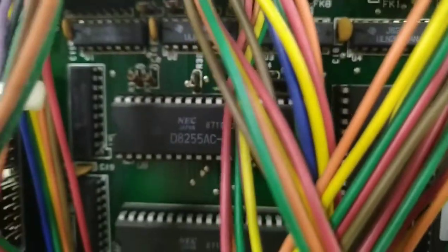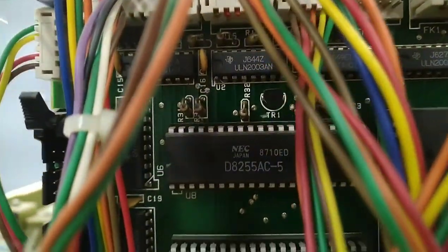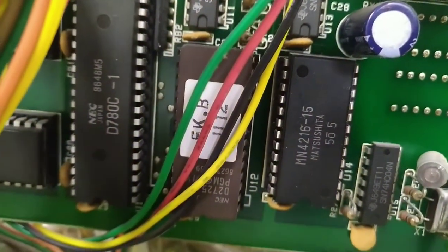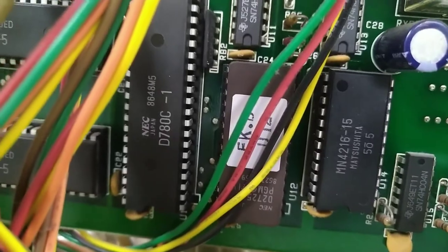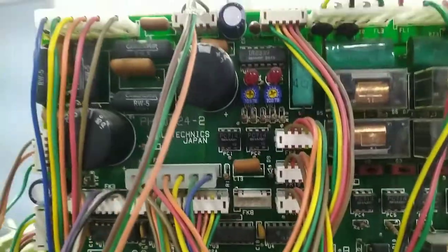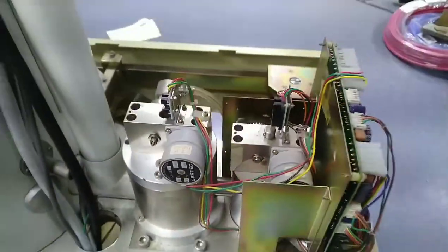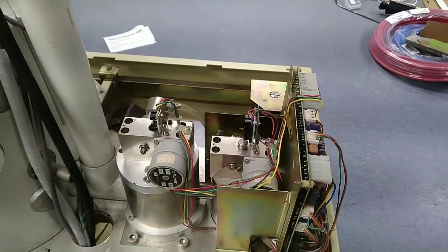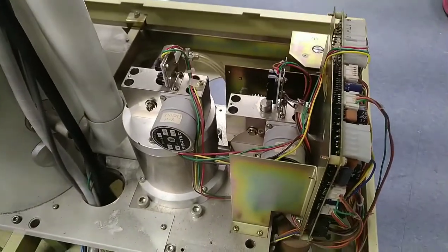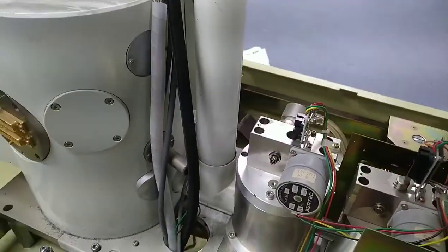Let me see if I recognize any of these ICs on here. I recognize some logic gates, Schmidt triggers, OR gates. Other than that, I don't know what these big chips are. I'm sure that's a ROM and various memory and processor chips. But I don't really know why it needs as much as it has here. I thought that was just a cover for a vacuum line — just an area where it can move from the rigidly mounted parts to the isolated parts. So that's something, for sure.